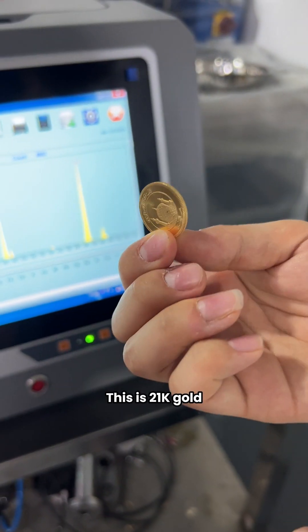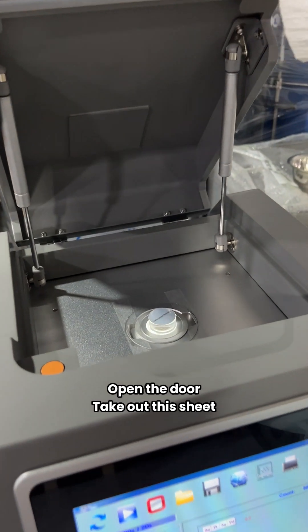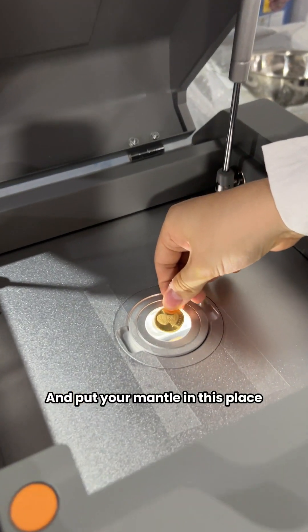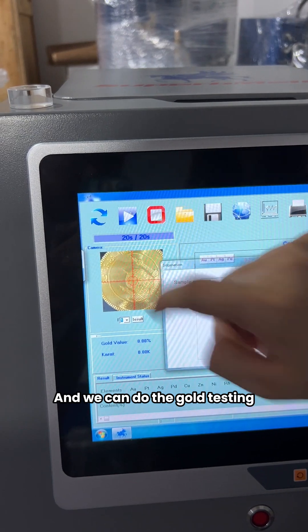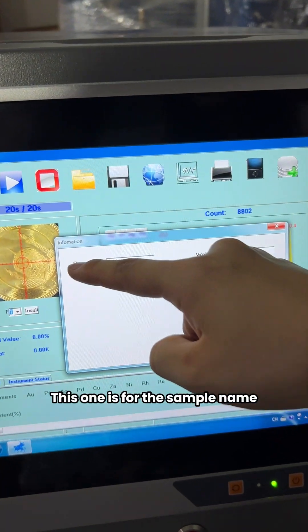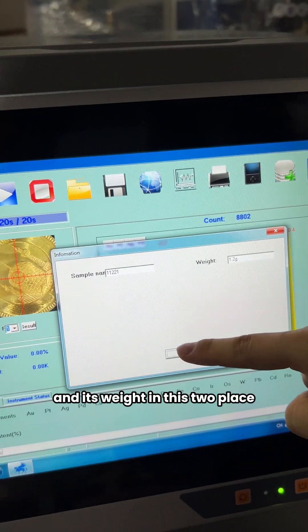This is 21k gold. Open the door, take out the sheet, and put your metal in this place. Close the door and we can do the gold test. In these two blanks, you can write your sample's name and its weight.